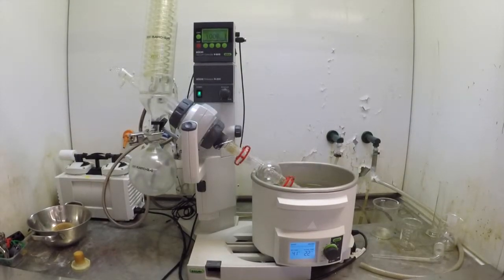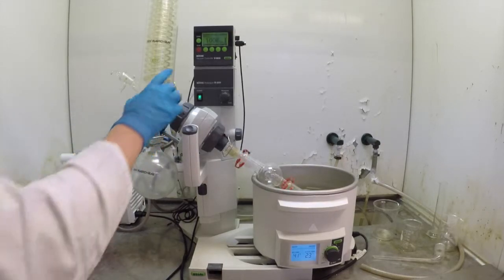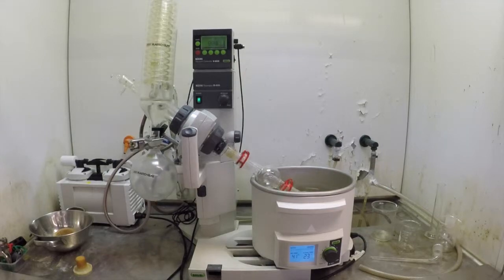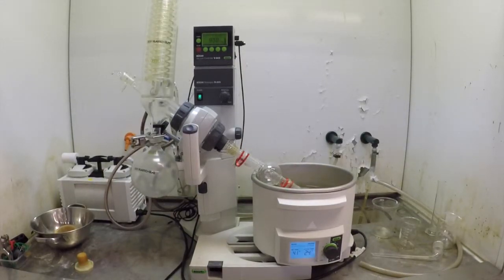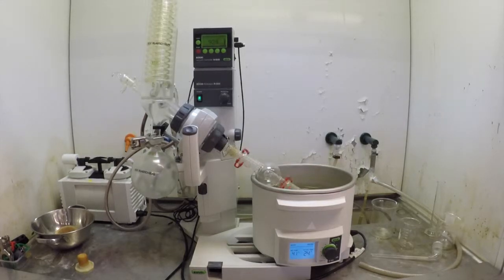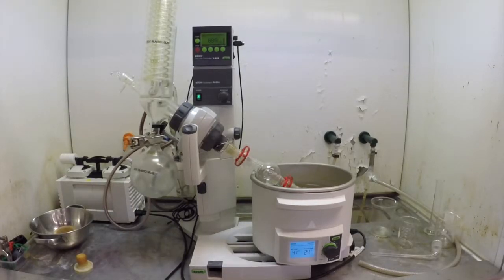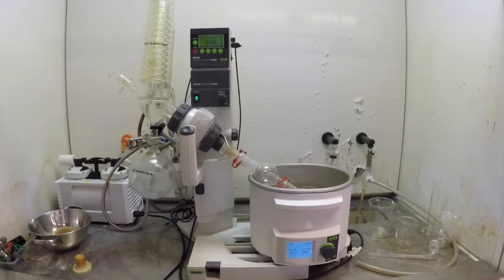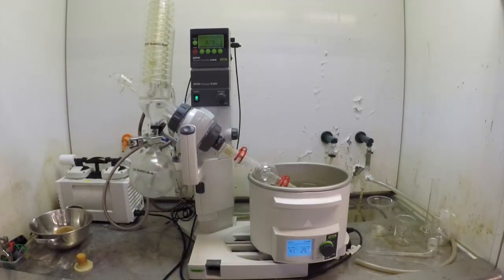This rotavapor has two settings for evaporating solvents: manual and continuous. In manual mode, a pre-selected pressure is chosen and logged into the rotavapor, and it will attempt to achieve that pressure rapidly. This increases likelihood of bumping both the solvent and product into the trap and the rotavapor, negatively impacting yield and potentially contaminating the system.